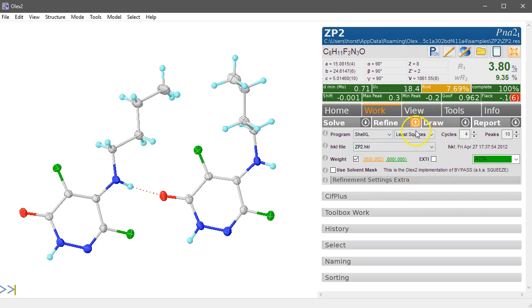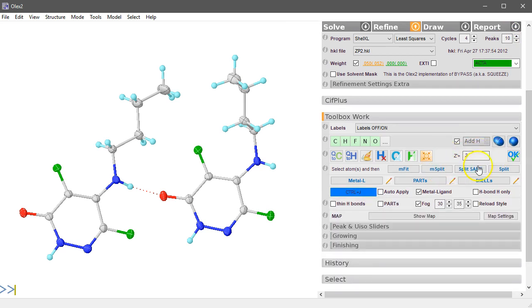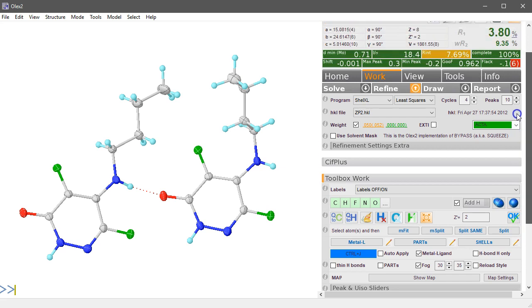Crystallography doesn't really know about this. And if we go into toolbox works, we can go and set this Z prime at will. It doesn't really matter. Crystallography doesn't care, but chemists do.